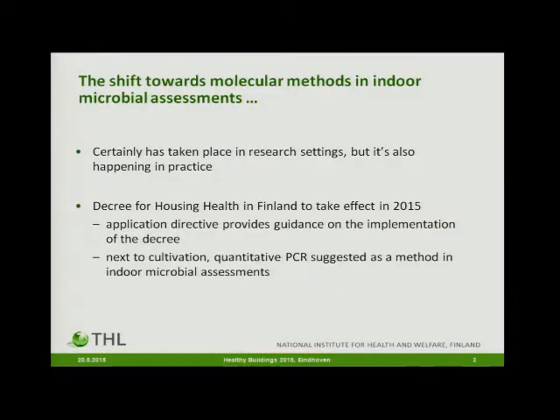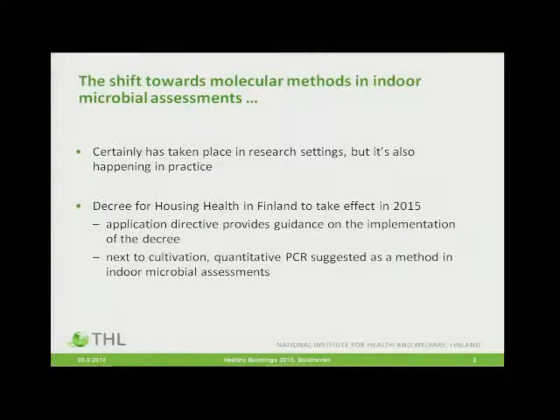So as Anne has been mentioning, we have this decree for housing health coming now into force, and we have an application directive on how to implement this decree. And what we're doing there is now we're trying to, next to cultivation, also provide guidance on quantitative PCR as a method in indoor microbial assessments.